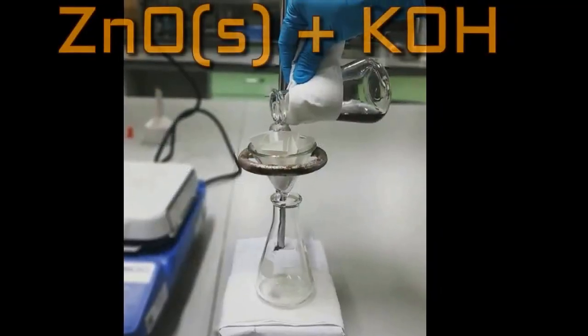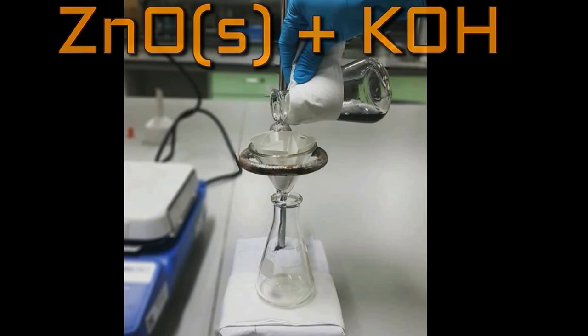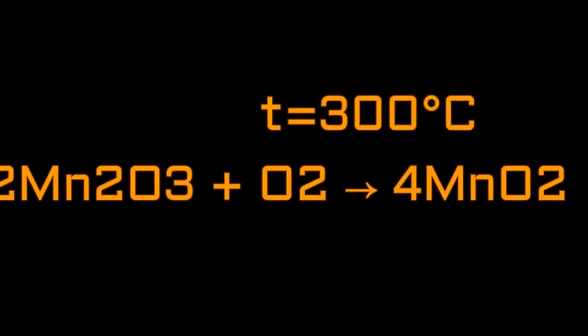I suppose that potassium hydroxide can be dissolved in water and filtered away from zinc oxide. Also, manganese oxide can be heated to produce manganese dioxide.